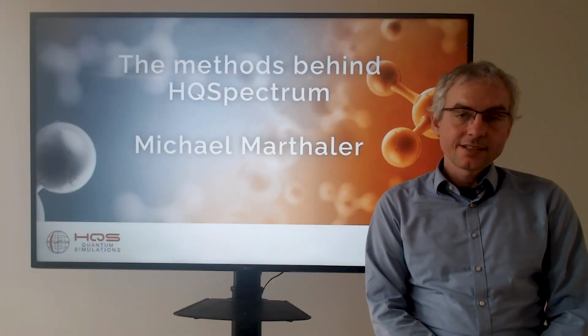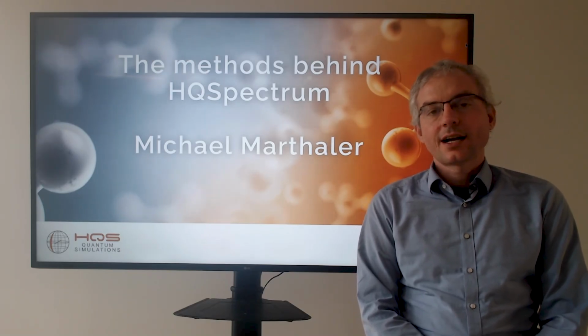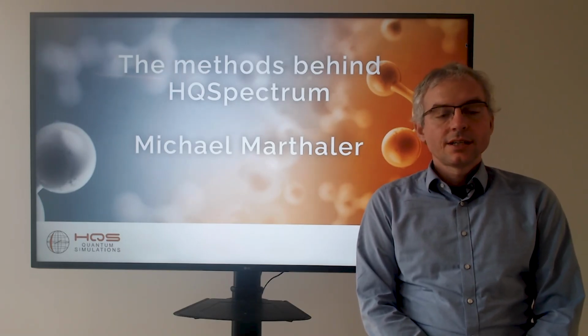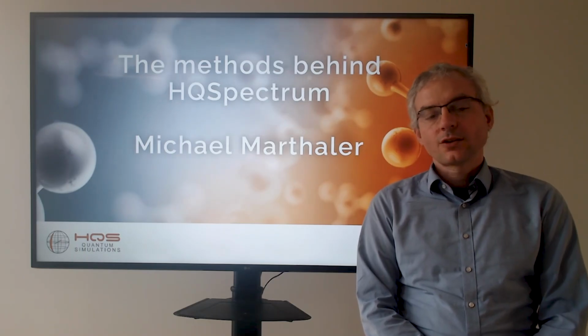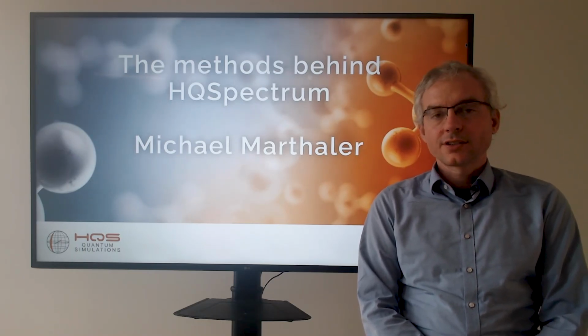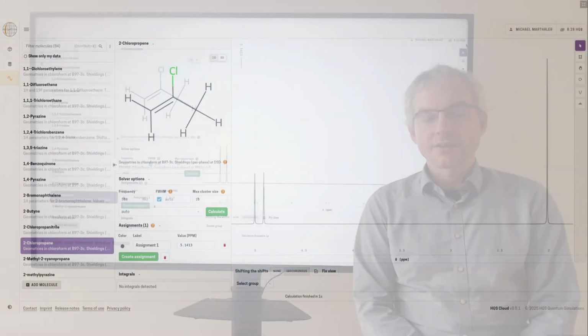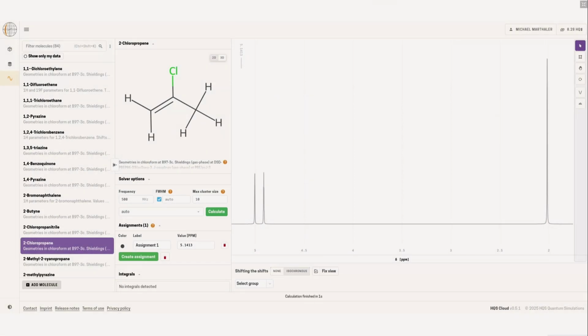So in this presentation, I will talk about the methods behind our NMR end-to-end software tool HQSpectrum, which is for spectral analysis of NMR. And here's a screenshot of how this looks. This is a browser-based tool that you can use to assign NMR spectra.